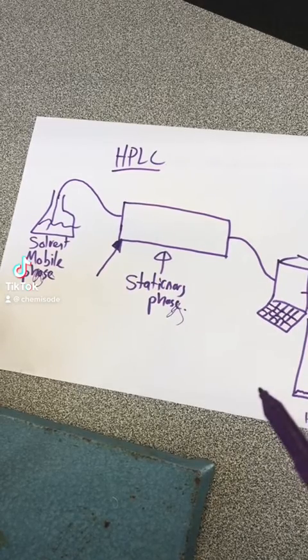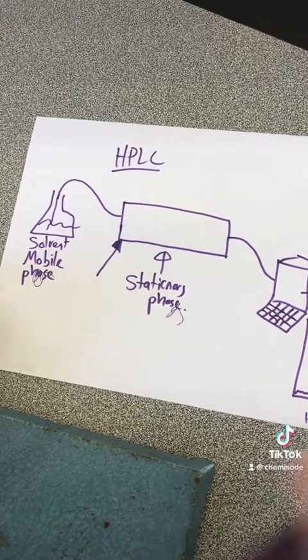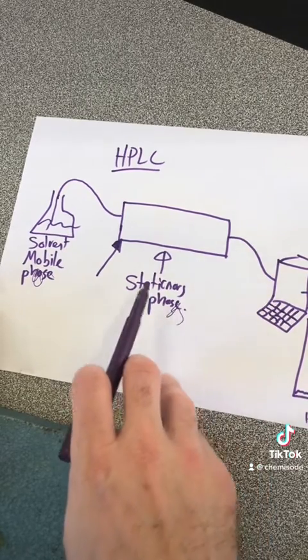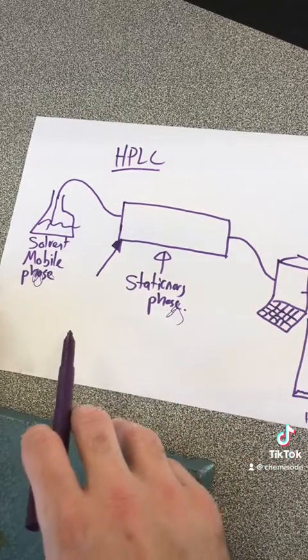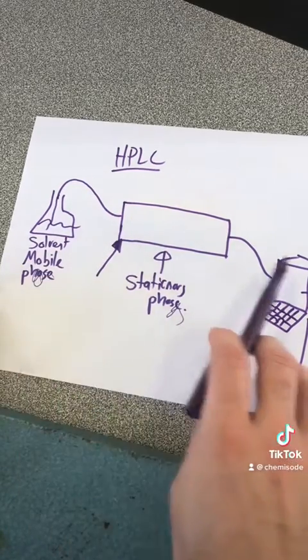So this is HPLC, and this is what most of the Year 12 stuff is about. And this is where we take our theory of chromatography that we learned in our paper chromatography, and start to apply it here. Instead of just some paper, we've got a column of our stationary phase, which is packed with some gel or some silica stuff that basically acts as our stationary phase. Our solvent, our mobile phase, is under high pressure and it's pushing through this thing here.